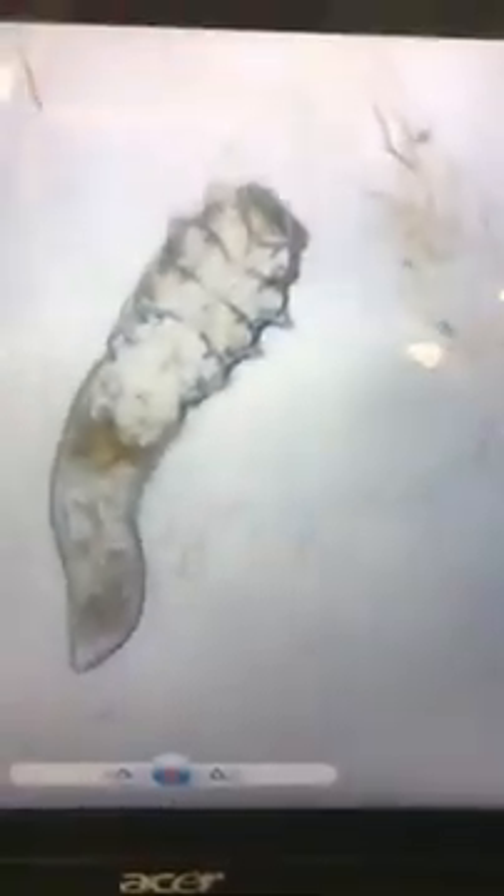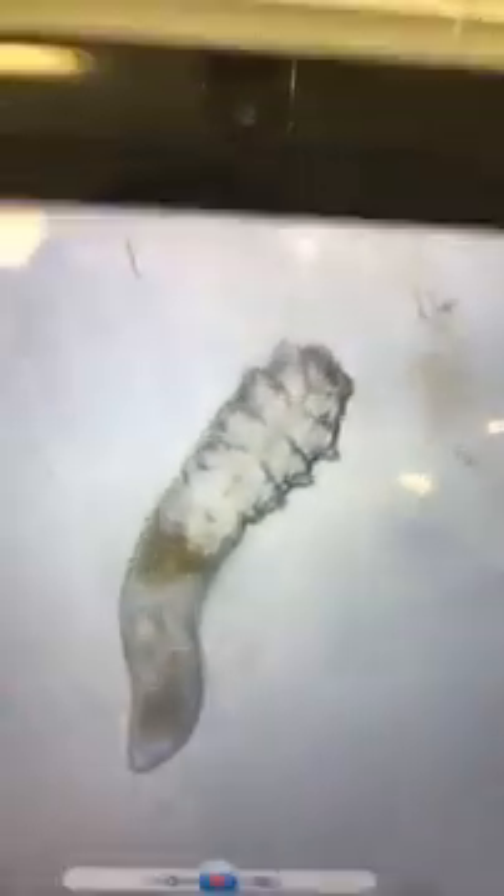There we go — okay, so this is what she looks like up a bit closer. You can see this way better. There are the little mouth parts — that's probably about as clear as we're going to get. You can see the underbelly, the short segmented legs, and the body. That's full of oil, eggs, and built-up faeces.